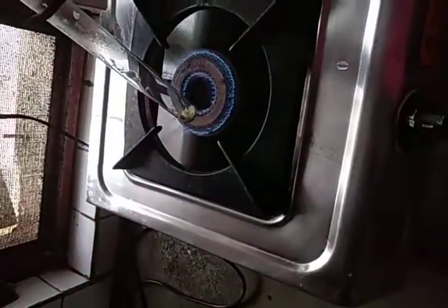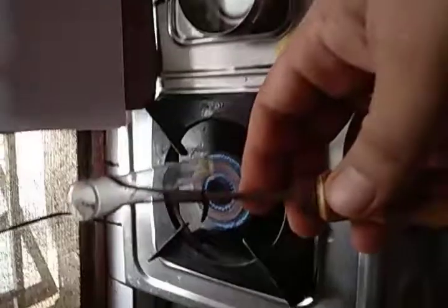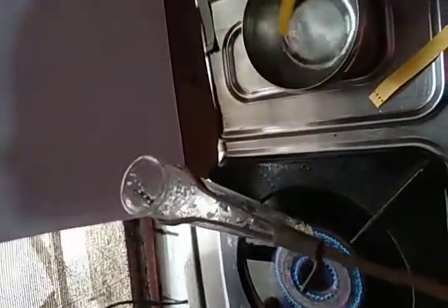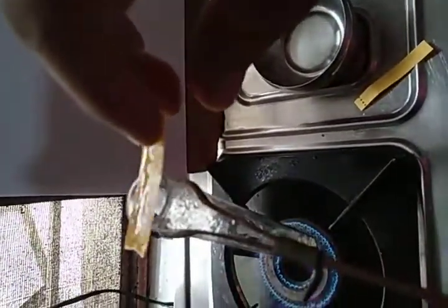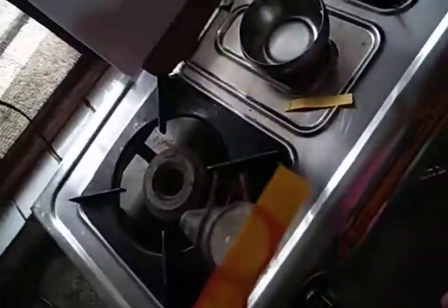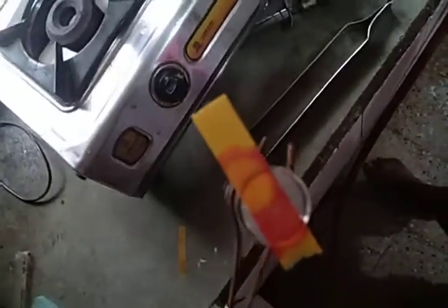Let us observe the heating of these crystals. Then we will put the wet paper on its surface. I am going to dip this wet paper and then put it on the surface of the test tube. You can see that this wet paper turns red due to the gas that is coming out from the test tube.